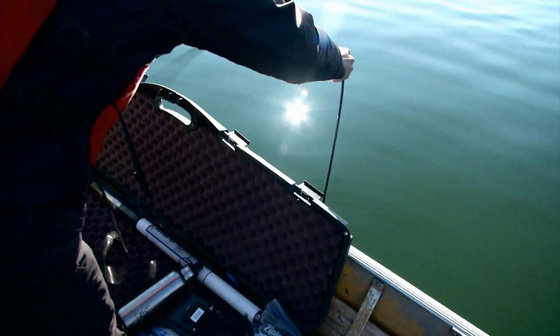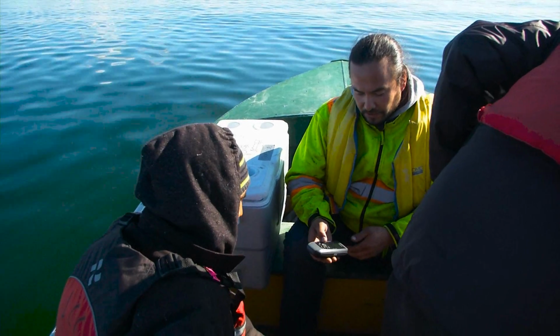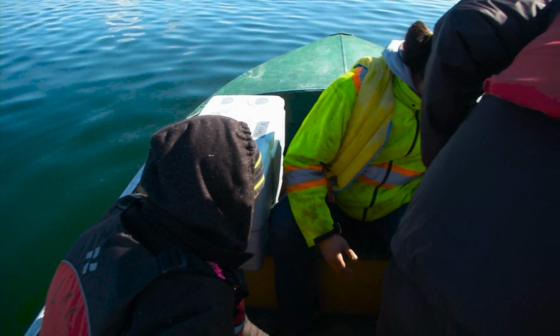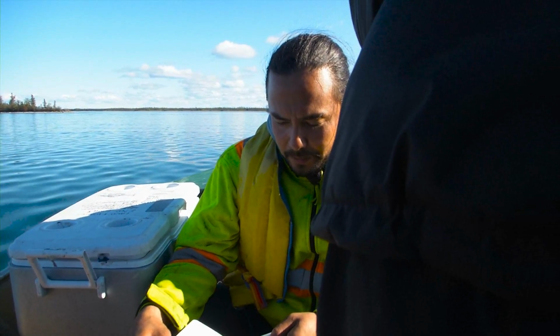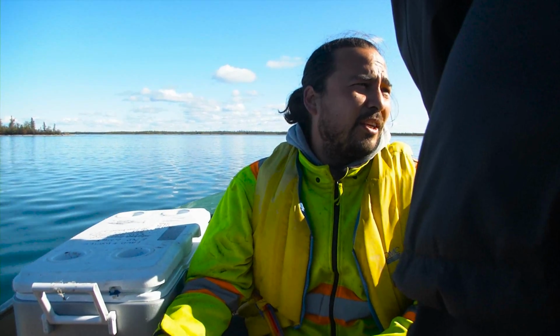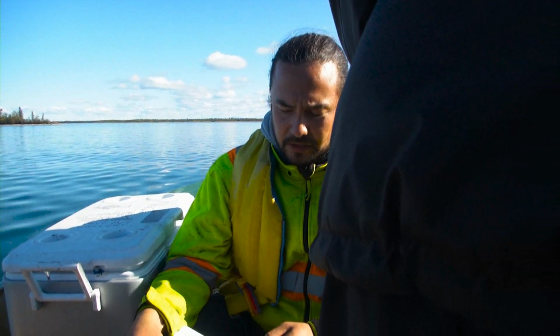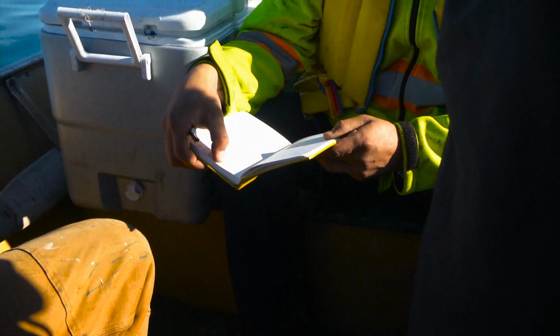So at every spot that we find out that we're going to do the sample test, you got to give the exact coordinates. So we'll write those down. What's going on right there? So for everything on that sonde you're using, we'll get the turbidity, pH, specific conductivity, temperature. We want total dissolved solids. So it's also going to measure solids that are dissolved into the water. It's going to give us dissolved oxygen percent. It's going to give us dissolved oxygen per milligram per liter.